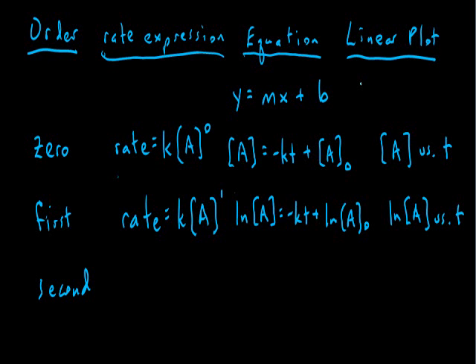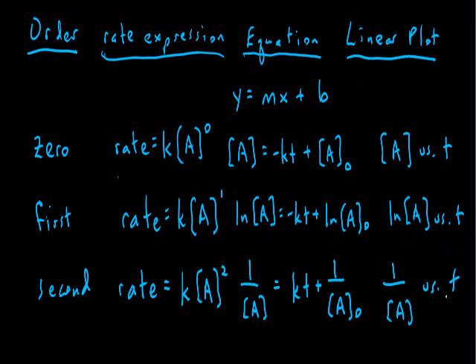If we take the same data and plot it where our plot is now the natural log of A versus time, and this plot comes out linear, it would tell us that the reaction is first order with respect to chemical A.